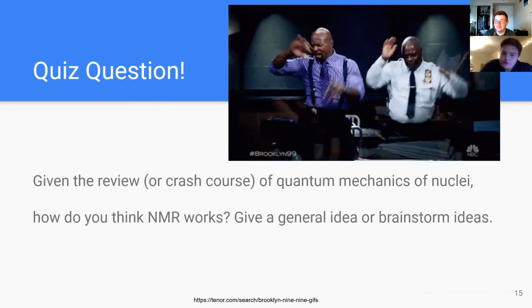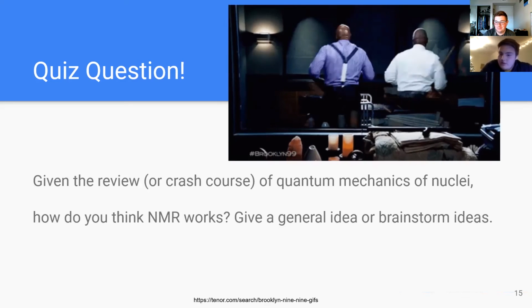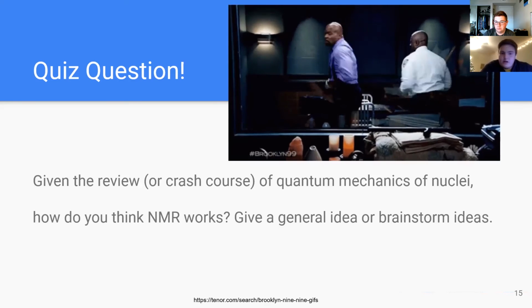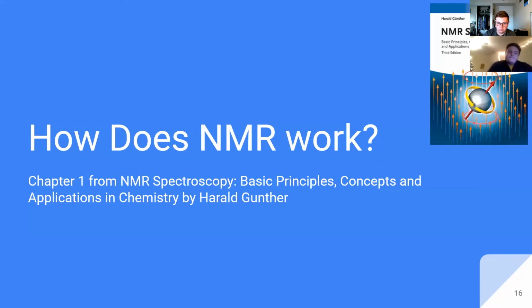And so we'll go through now how NMR works just in general. I think we have a good idea, but let's just get it out there. And again, this is basically going through this NMR book. I didn't say this before, but you can get it through UKY Library. It's just an easy download of it, and it's very helpful when understanding this NMR spectroscopy.